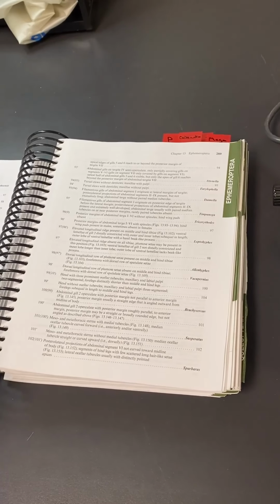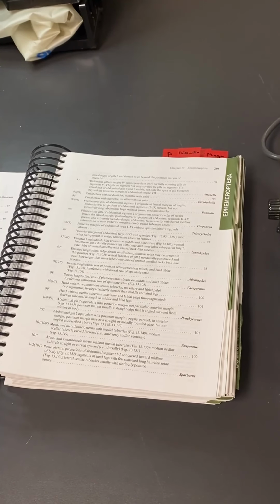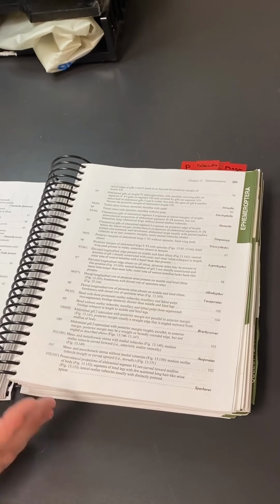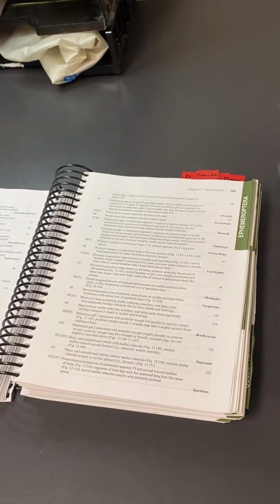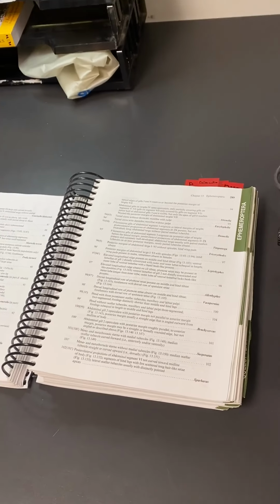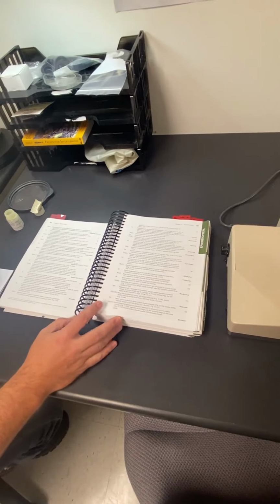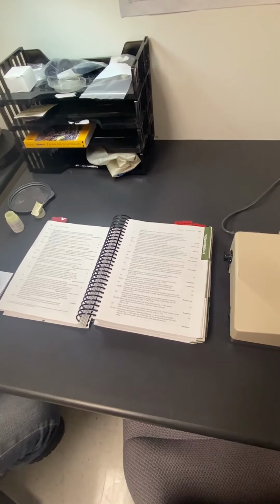Sometimes the bugs might be damaged, or they're early instars, which are freshly hatched, and they don't develop all the characteristics that you need to identify them. So you might not be able to identify them all the way down to genus, but most certainly we can get them to family, which is fine. That all helps in our calculations when we put all those in our metrics.